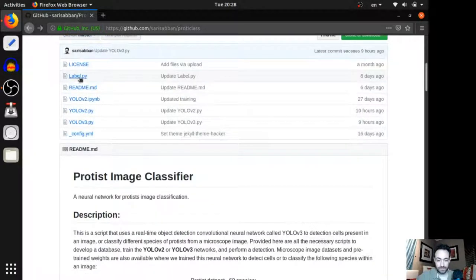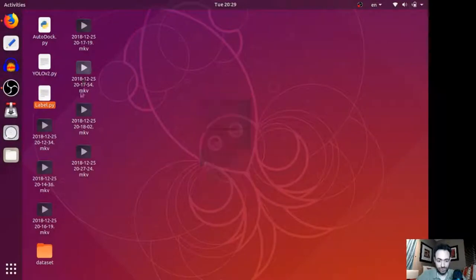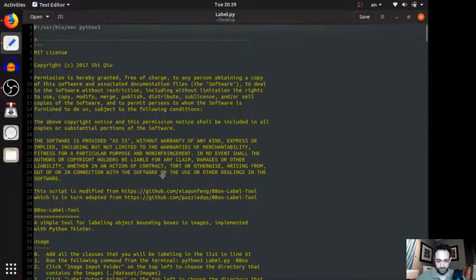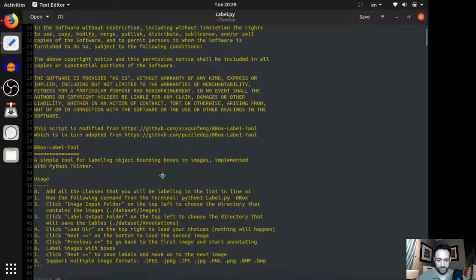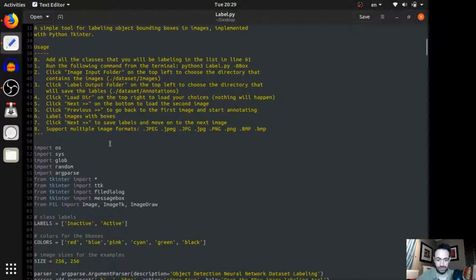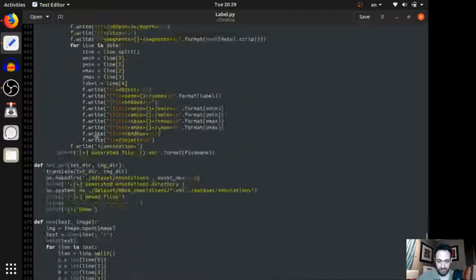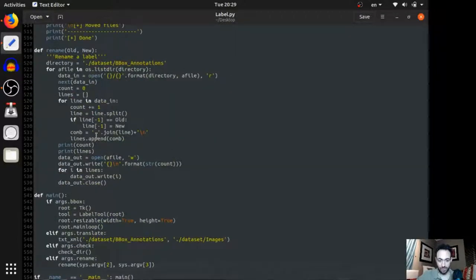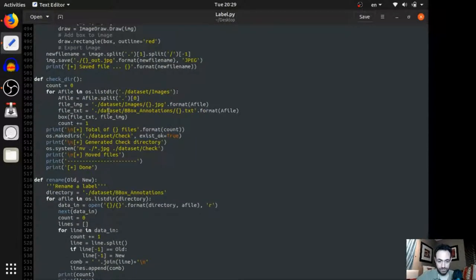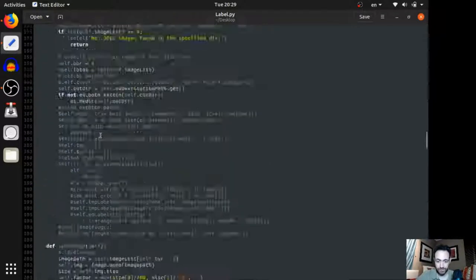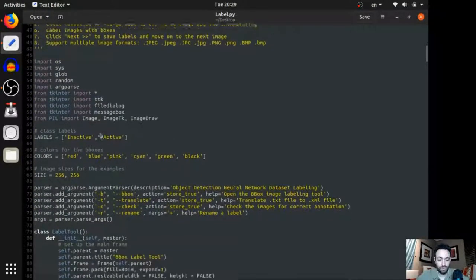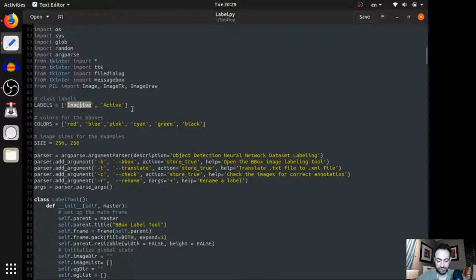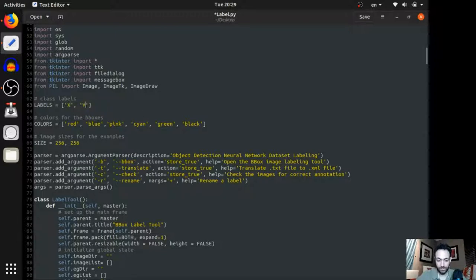So, this script here is what allows us to label images. If we take a look at it, again, it was written by someone else. So, this is the license for it, of course, and a little bit of how to use it. And then I've added a little bit of my script here on top of his work to make it easier to use, at least for this project. And we start by adding the labels. So, here, for example, let's say we have two species of cells. Let's say species X and species Y. All right, we save this.